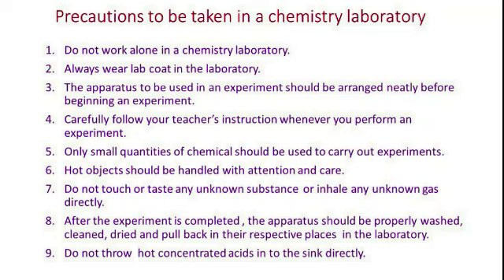In chemical laboratory, many chemicals are there. So, do not touch or taste any unknown substance or inhale any unknown gas directly. After the experiment is completed, the apparatus should be properly washed, cleaned, dried and put back in their respective places in the laboratory. Do not throw hot concentrated acids into the sink directly.